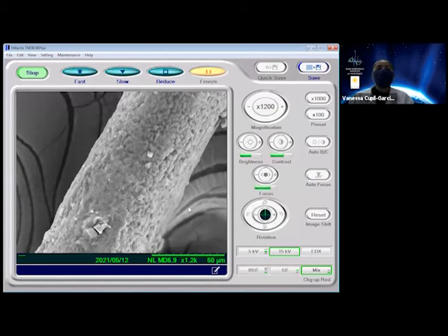So this is our last sample. And with the SEM, you can analyze a variety of samples as long as they're dry and not wet, because they have to be dry to go into the microscope. So you could look at leaves, insects, flowers, basically anything you can find in nature, a spider's web, a piece of rock or a piece of dirt.